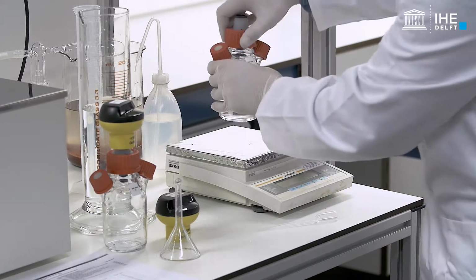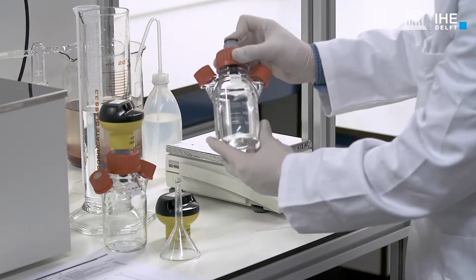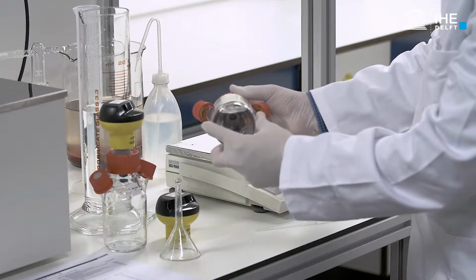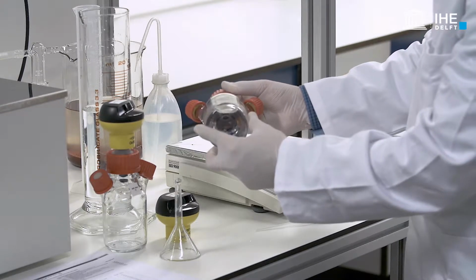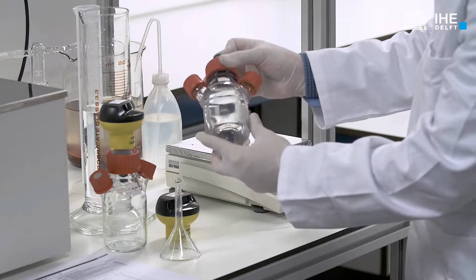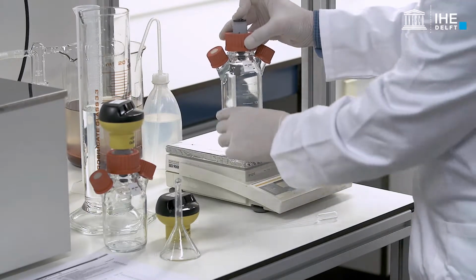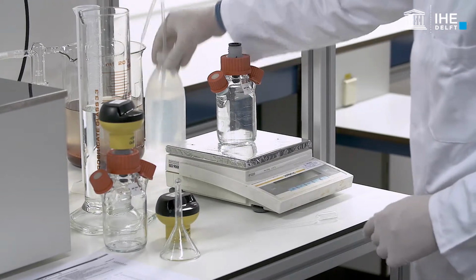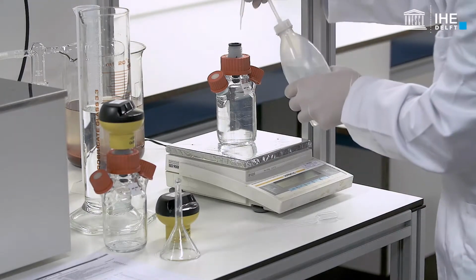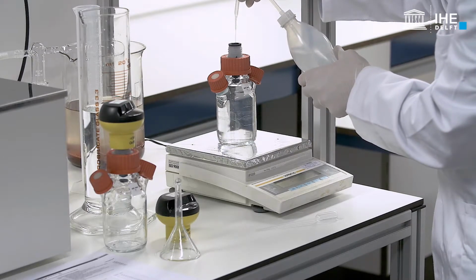Before filling up the reactor to the top, reassemble it to recreate the actual working volume. Attention should be paid in order to remove any air bubbles entrapped during the addition of water. Then fill up the reactor to the top.